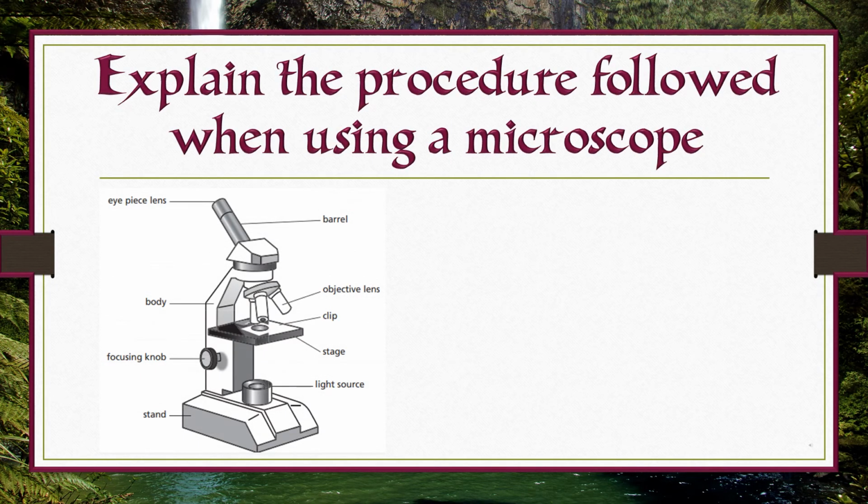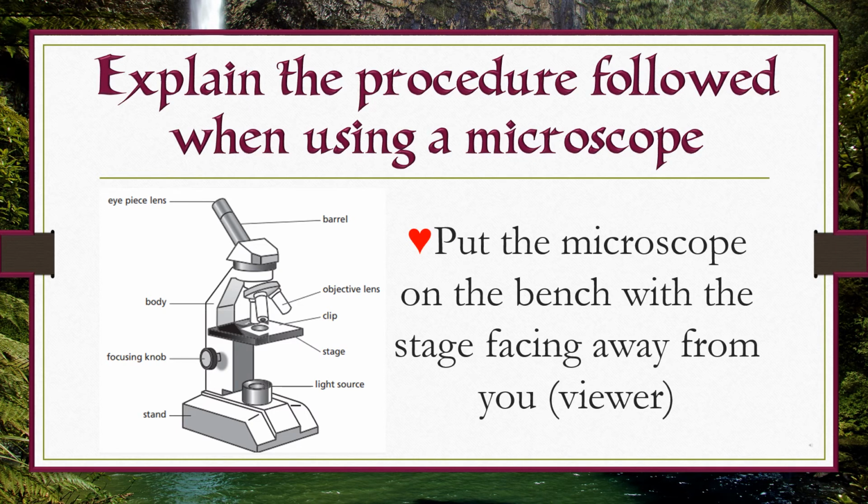Explain the procedure followed when using a microscope. Put the microscope on the bench with the stage facing away from you.